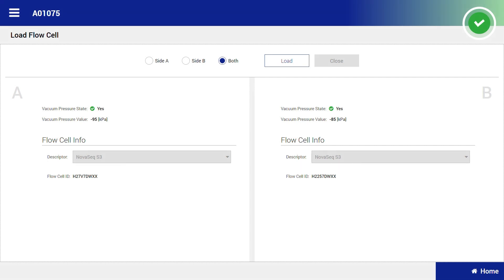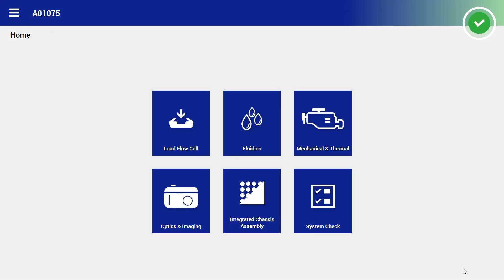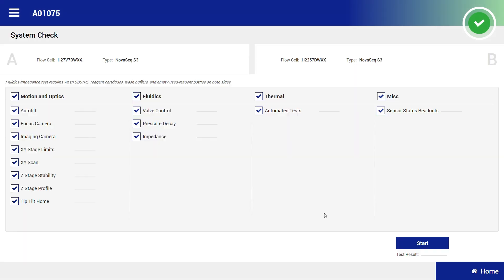Click home on the bottom right corner and select system check. Confirm that all tests are pre-selected and select start.